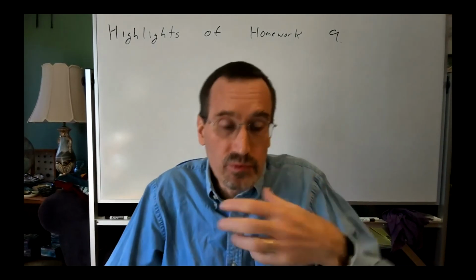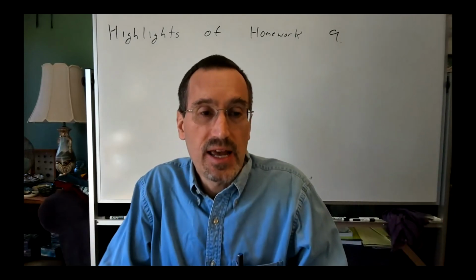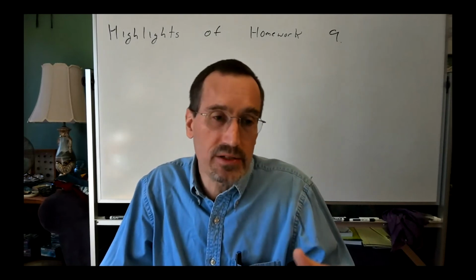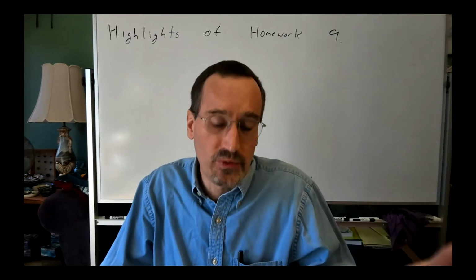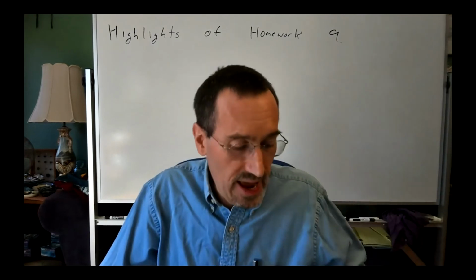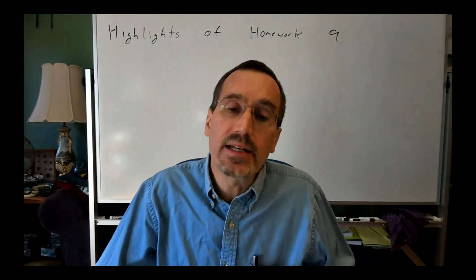I love really pretty spectra where you can see all your resonances, and we often select for them in the course, but sometimes nature isn't so kind, and no matter what you do, whether you switch from chloroform to benzene or not, your resonances are going to overlap and you'll have a mess. And that's what I wanted to create in this problem here.